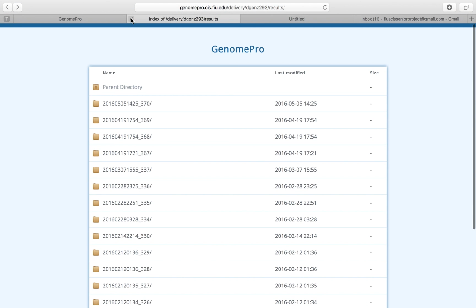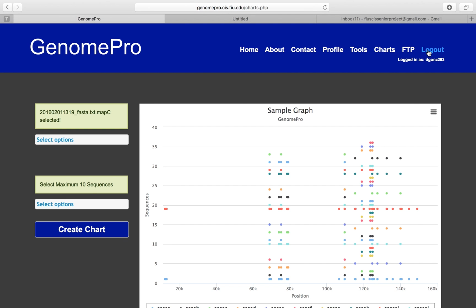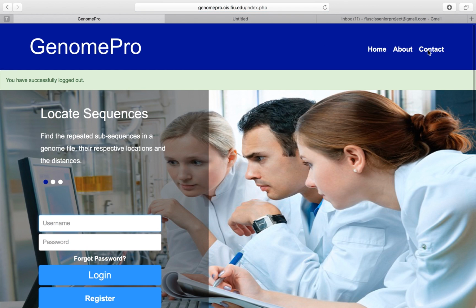And once you're satisfied with that, you can log out, and that's all there is to do in Genome Pro.